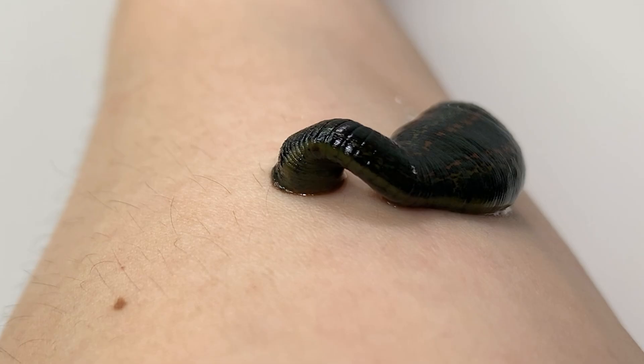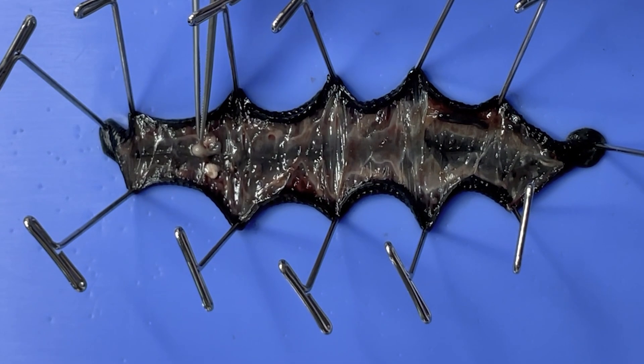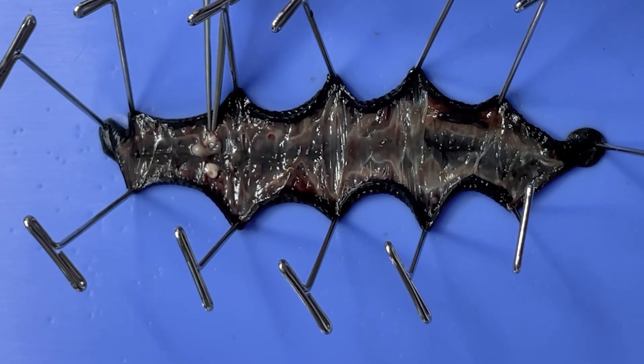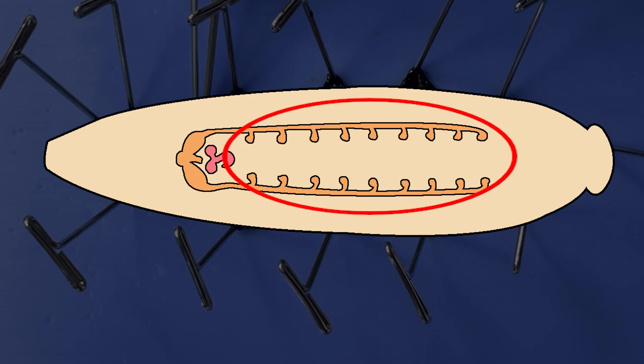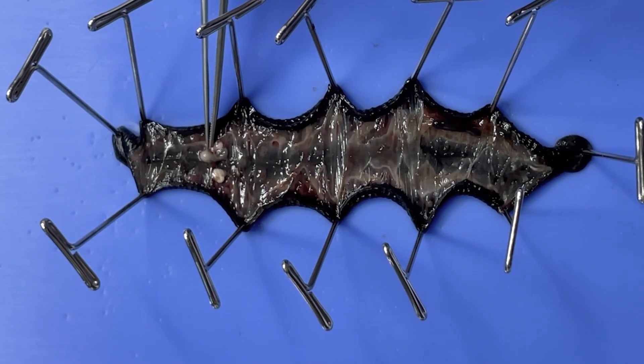They can both inflict wounds on their prey and inject saliva into the prey's body. These structures here are where sperm is stored and released. After sperm is generated in the nine pairs of testes, it is stored and later released from this area.